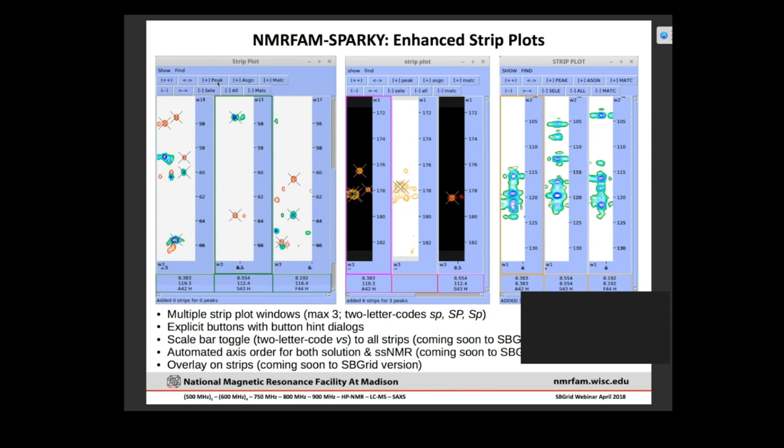So if you have no idea what they are, then you can just get some idea from putting your cursor on those buttons. So I implemented these hints in a few plugins. Then I'm going to try to make more hints on the other useful tools that are less documented in the future.